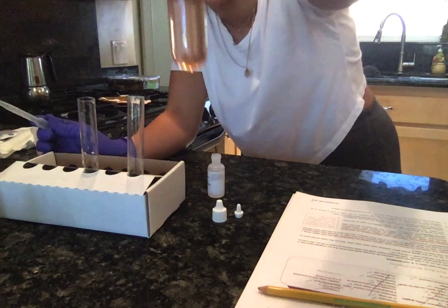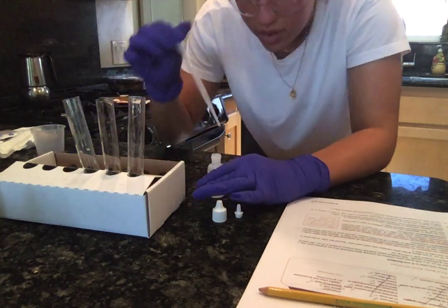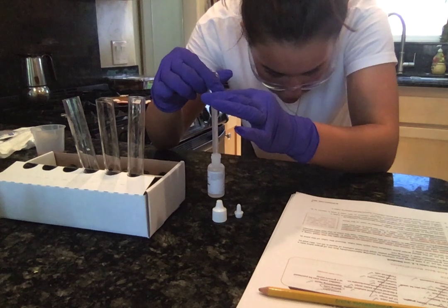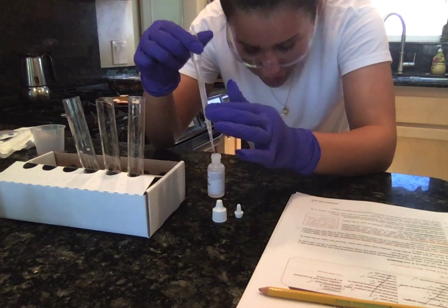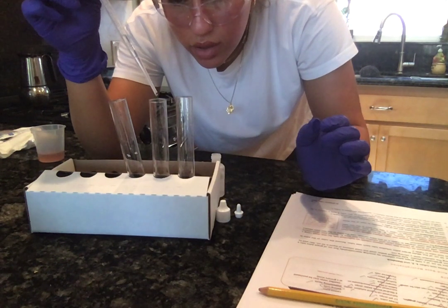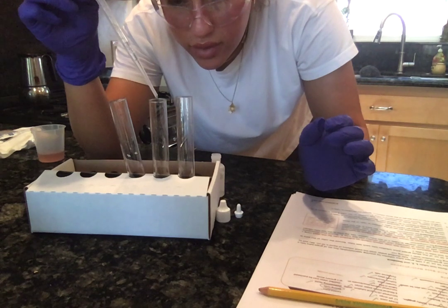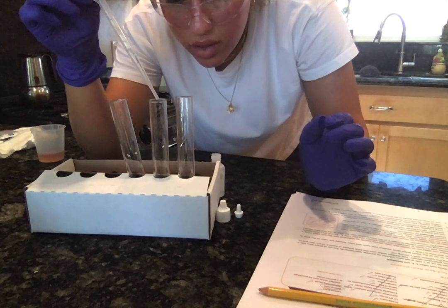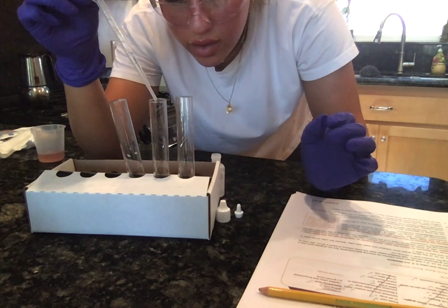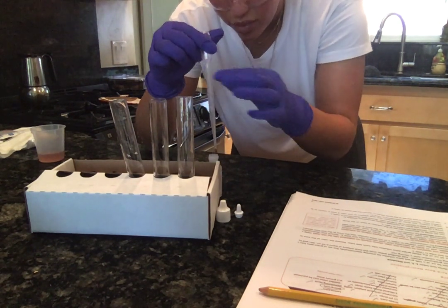So if we look before, this is the color. It's kind of a clearish pink. And now let's put this in there. One, two, three, four, five, six, seven, eight, 9, 10, 11, 12, 13, 14, 15. Put the remainder back in here.